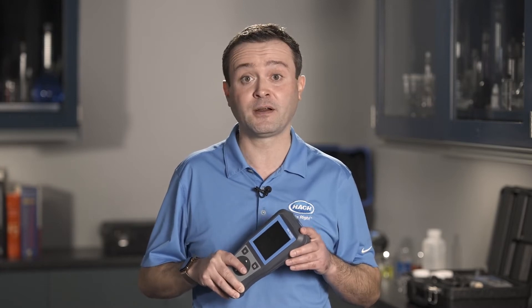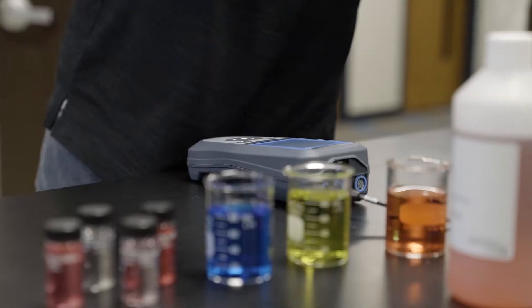We know that customers are faced with many issues using their current field instrumentation, including not having a truly robust meter, poor data management functionality, and a lack of standard work for measurement and calibration needs.